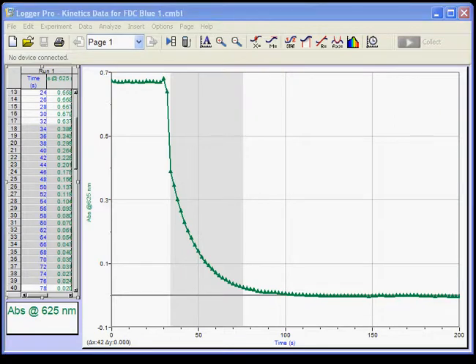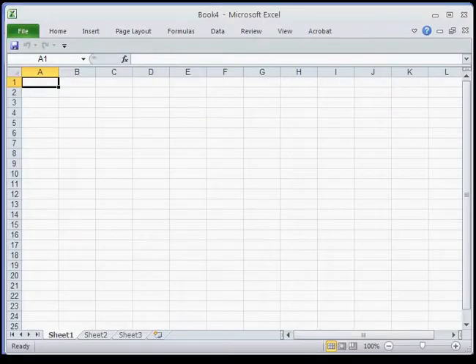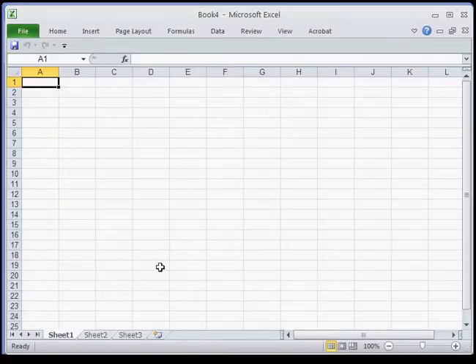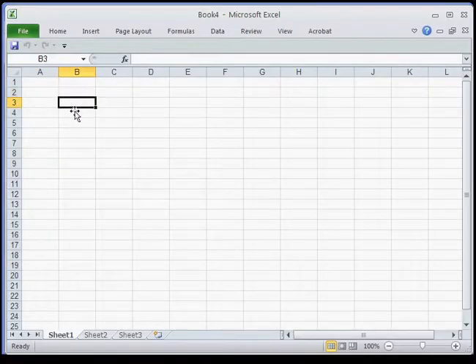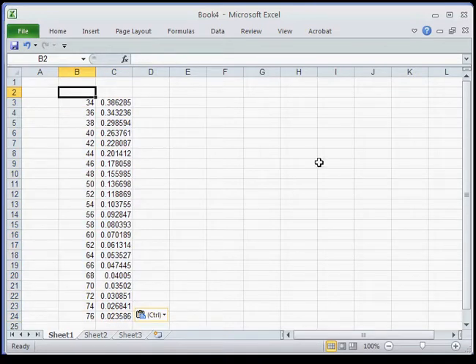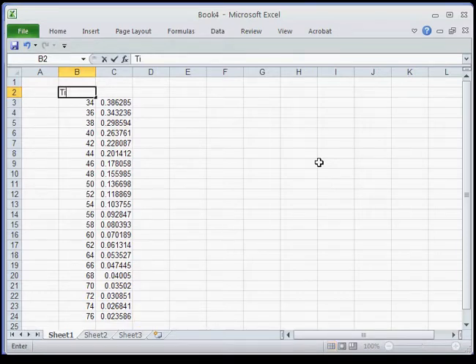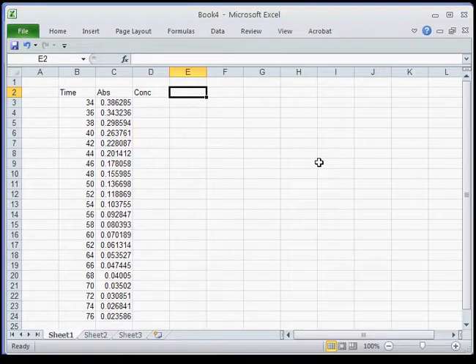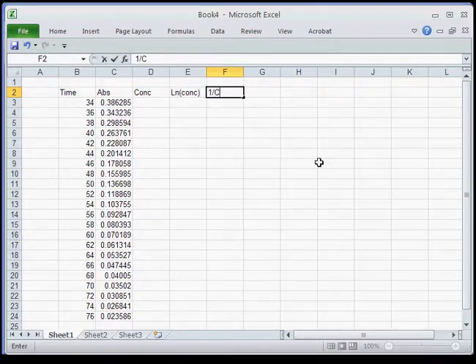Next I'll open up an Excel file and paste the data in. I'll paste it down here because I want to put some headers on top. This column is time — we'll have to fix that because we don't want to start at time equals 34; it's more traditional to start at time equals zero. This column is absorbance. Absorbance is not concentration, so we'll have to correct that. I'm typing the headers in using the cursor keys to move over.